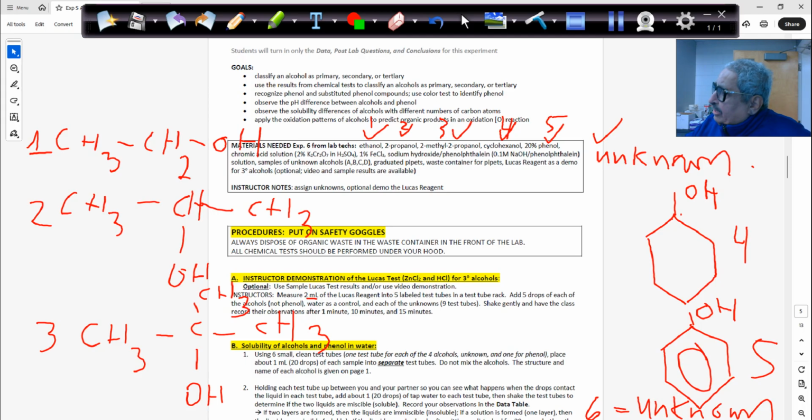You have to be consistent, taking 1 at a time. All the 6 test tubes, including your unknown, give them the same type of treatment, chemically or physically, correct? So I'll show you how to get those. But you don't need to take 8 or 9 or 10 test tubes. That's a typo.